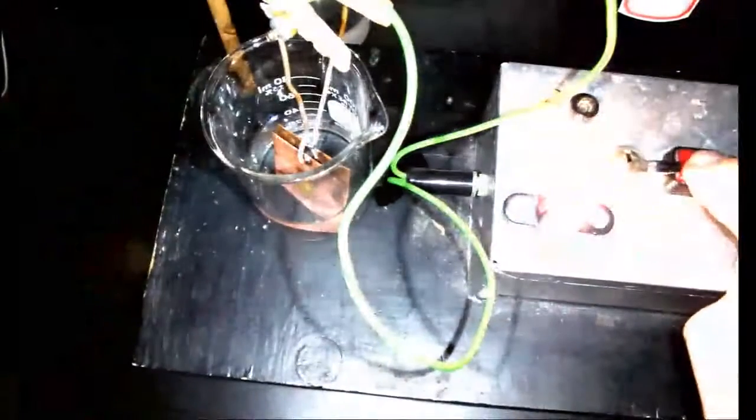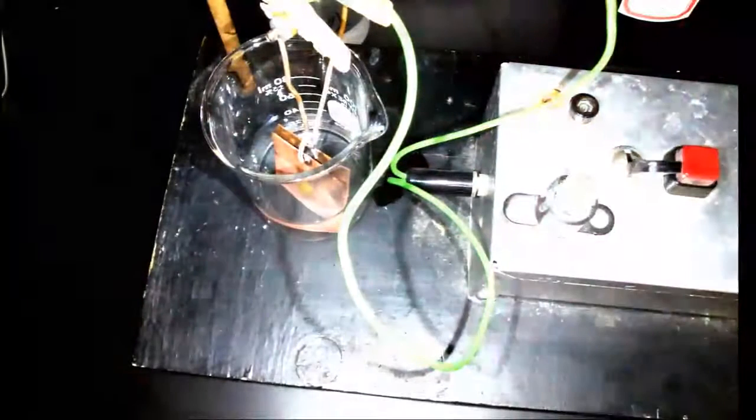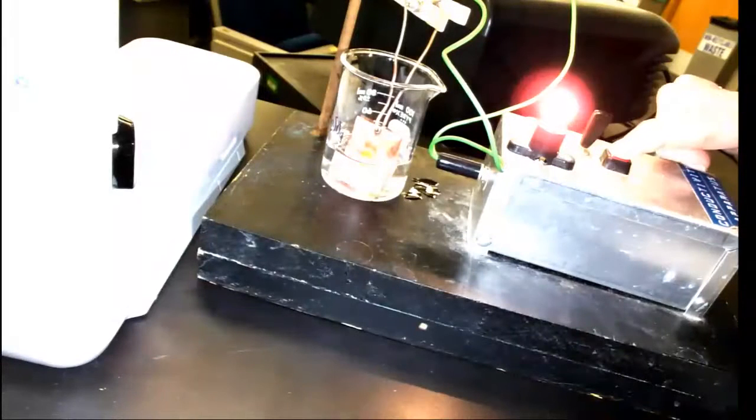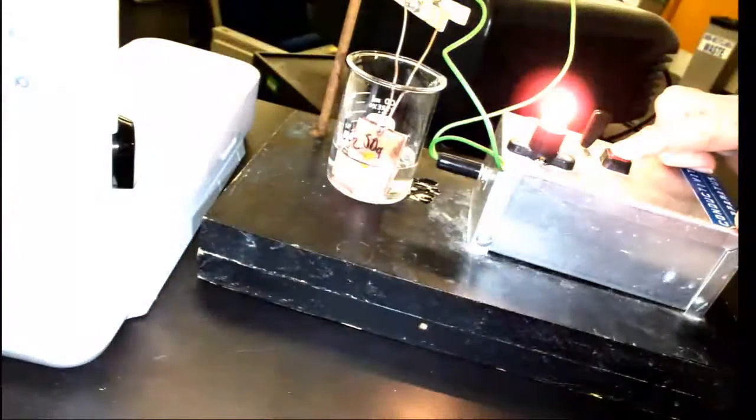Uh-oh, now can we see it or not? Can we see the glowing light bulb? What do I have to do to show you the glowing light bulb? I have to figure out something to try here. OK, now I've discovered the geometry that works. So now you can tell with the electrodes in the sulfuric acid solution, it has a very brightly glowing bulb. All right, test solution number one.